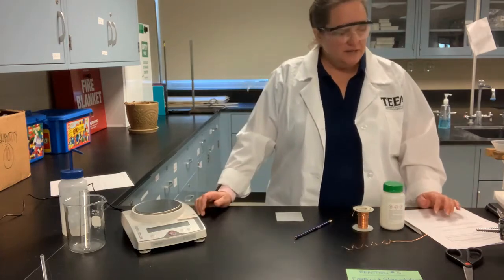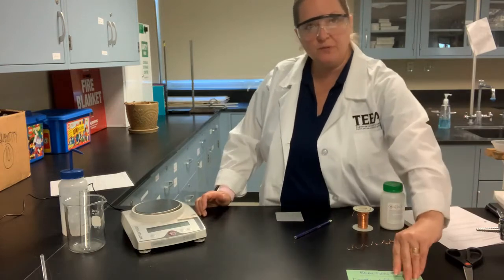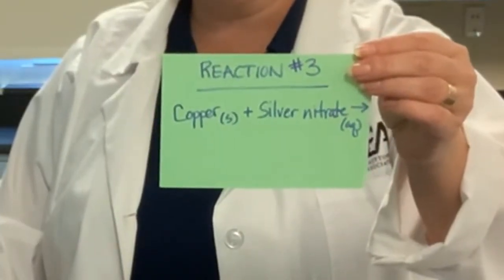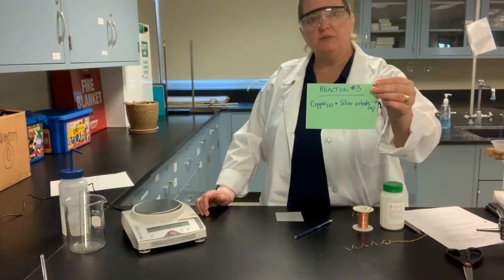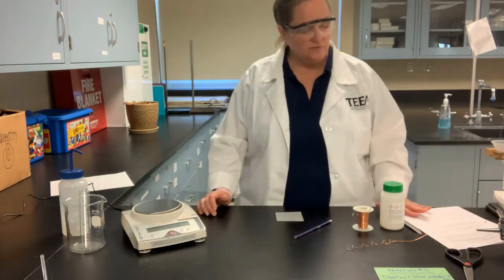Okay, students, the reaction that I'm going to be showing you here is reaction number 3 of the stoichiometry lab. And this card here has the details of the chemical reaction that's taking place. It's copper solid reacted with silver nitrate aqueous solution. And again, this is reaction number 3. So you want to turn to reaction 3 in your handout.